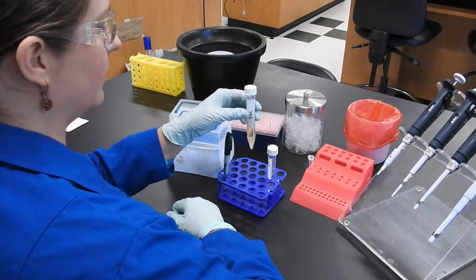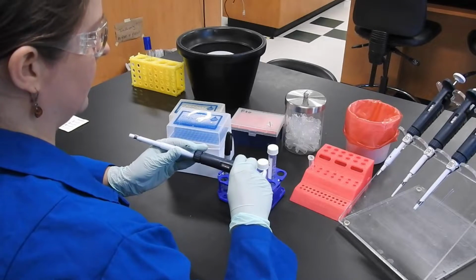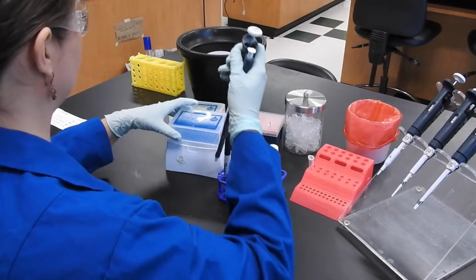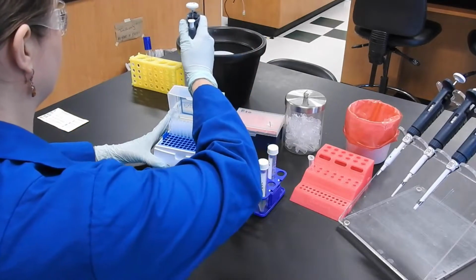SOC is a very rich liquid medium that allows the bacteria to recover from the transformation step and begin dividing. The cells will also start expressing the resistance gene. Check your protocol for the exact amount of SOC to add.